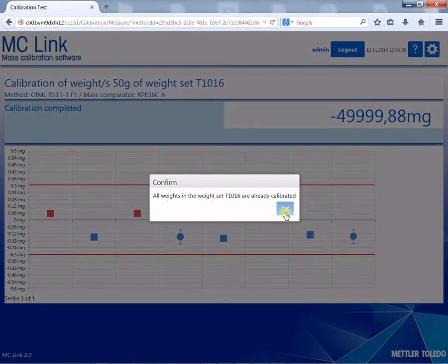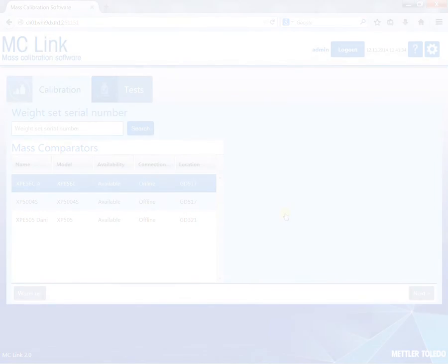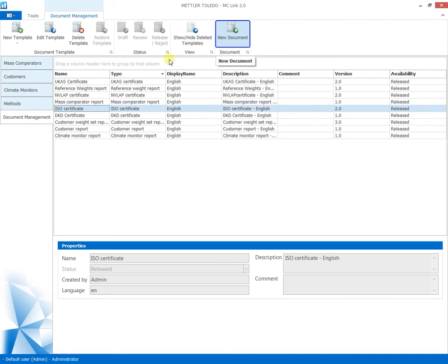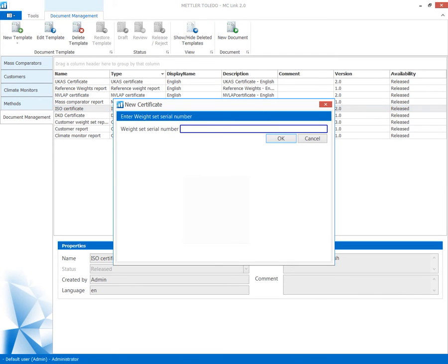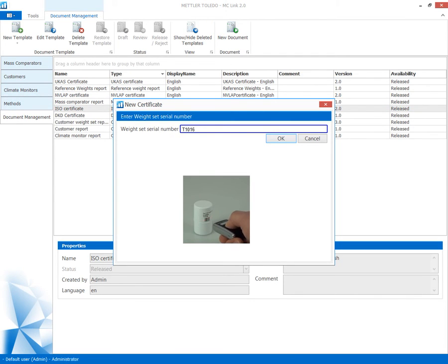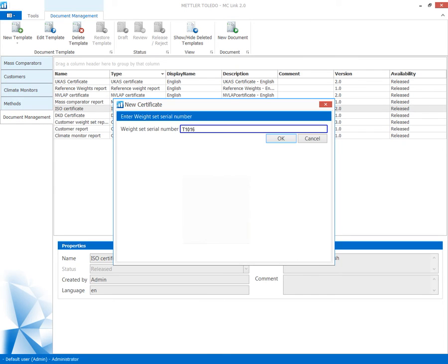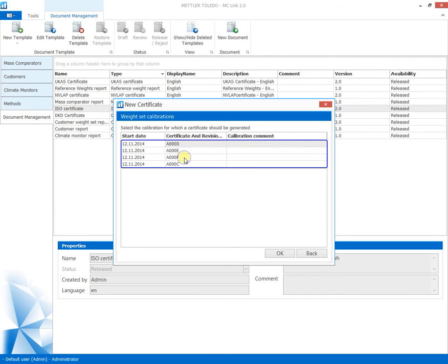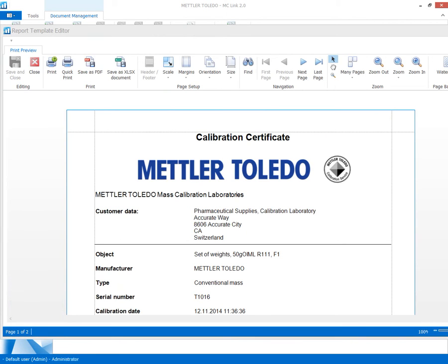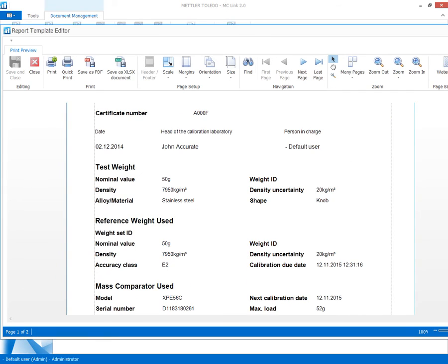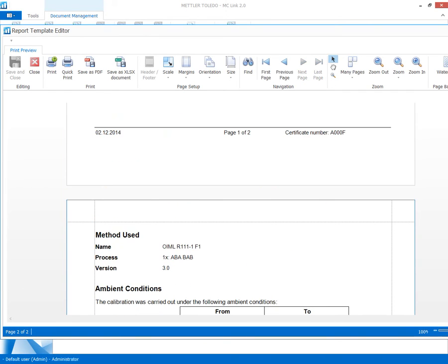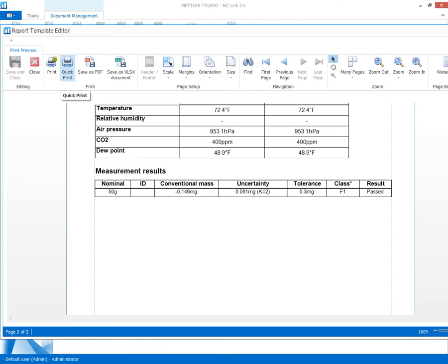The mass calibration process is now complete, and printing the calibration certificate is the last step. One of the predefined and customisable certificate templates is selected, and the weight set ID is read in using the barcode reader. By selecting the desired calibration, the certificate is populated with the customer address, weight set and process details, and the final calibration results. It indicates all details for regulatory compliance.